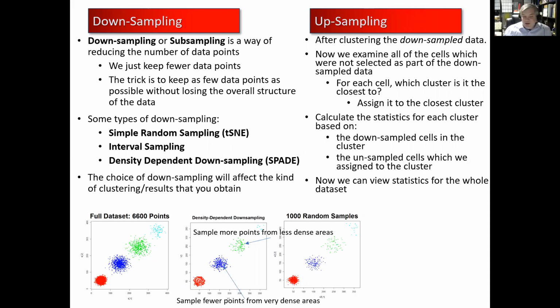Now, if we have a million events and we're going to take 100,000 of them, there are a lot of ways we could cut that. We could do simple random sampling, where we just grab event number 1755, 2786, and so on across a million events, randomly grabbing data points. Or we could be a little more structured. We could say, take event number 1, 5, 10, 15, 20, every fifth event up to a million, and that will give us 200,000 events when we're done.